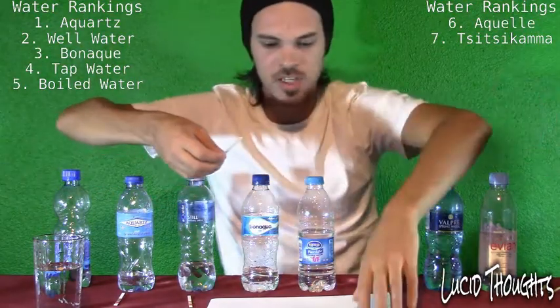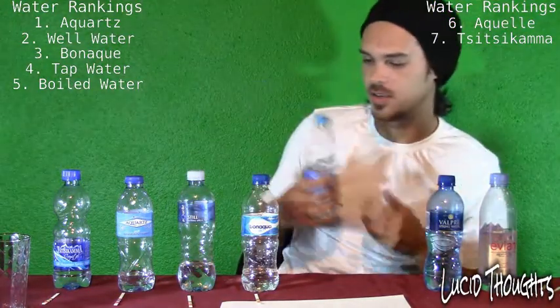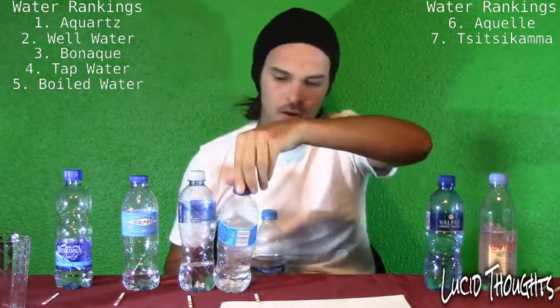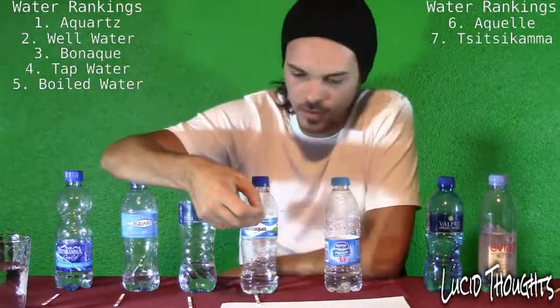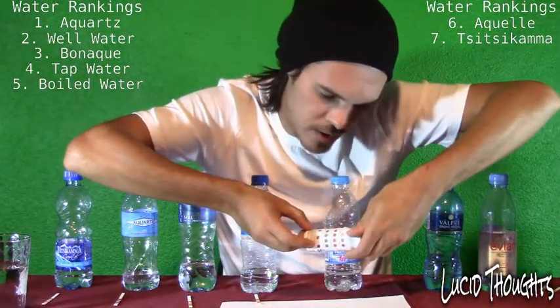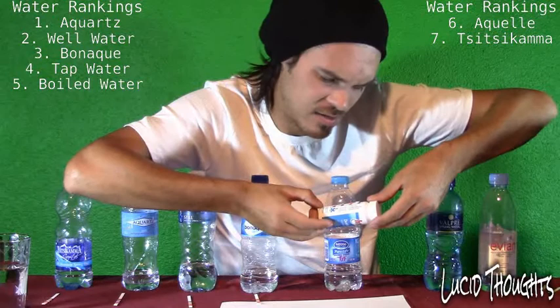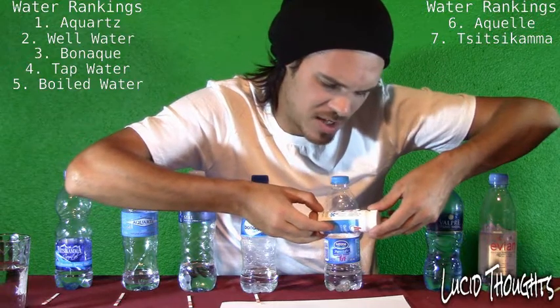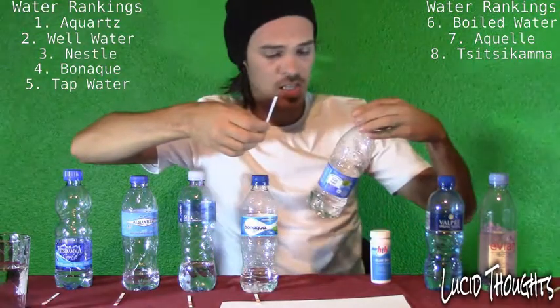Now we have Nestlé Pure Life — I know this is international. Worth noting that Valpré and Bonaqua are both Coca-Cola brands. Testing Nestlé Pure Life: chlorine is 0.1. The pH level looks pretty good — about 8. The alkaline is very high, about 210 to 220. That is good water. Well done, Nestlé Pure Life.